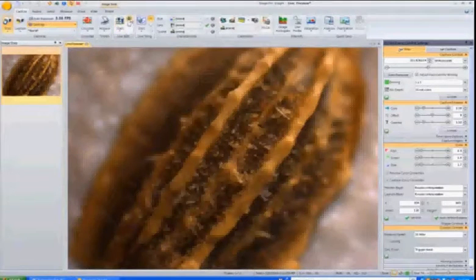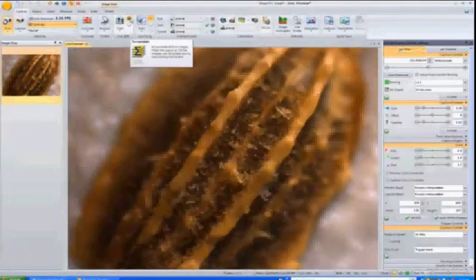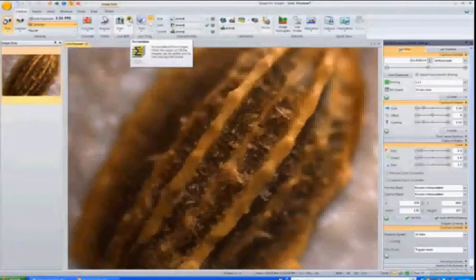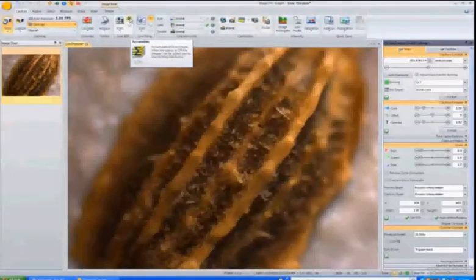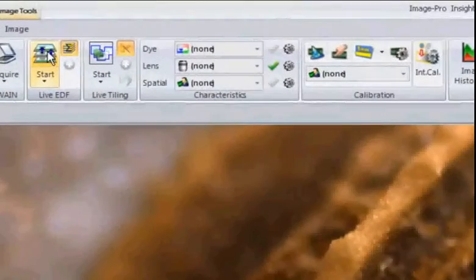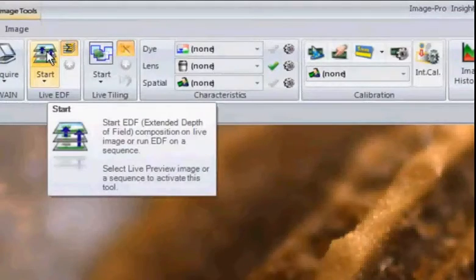If you notice, this box is checked, which is going to, on the fly, accumulate the images and choose the portions of each image that's in the best focus. By the time we land at the end, we'll have an entire image fully in focus.